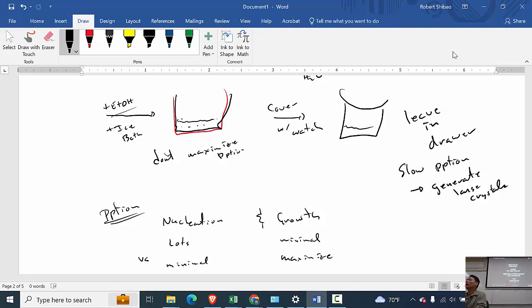What else? Oh yeah, the dichromate is sitting outside the hood right now. I might move it inside the hood along with the balance. Okay. Just be careful of any spills. If you do spill some, I normally use a wet paper towel to wipe it up, not a dry one, because I don't want to generate any dust. Just a slightly damp, not dripping wet, towel works well. We can put the solid waste, if you have a paper towel, in the tray inside there.